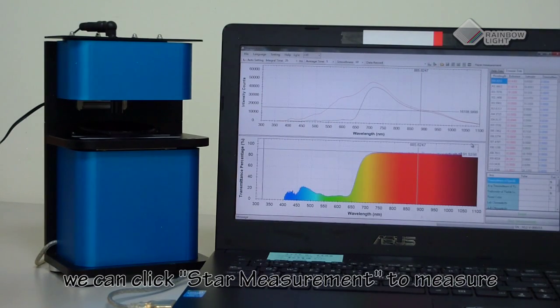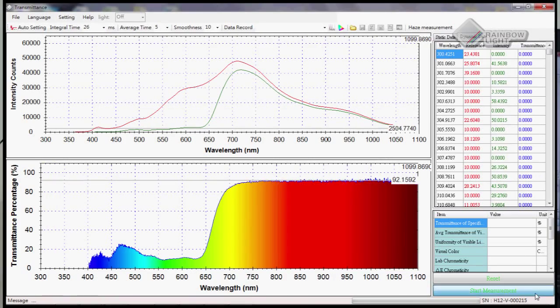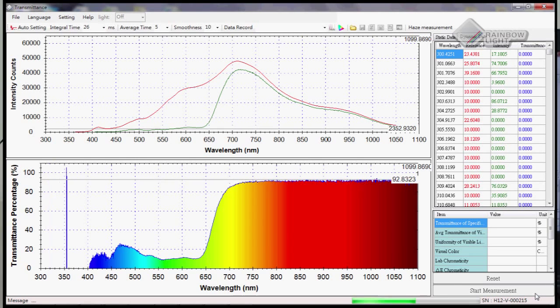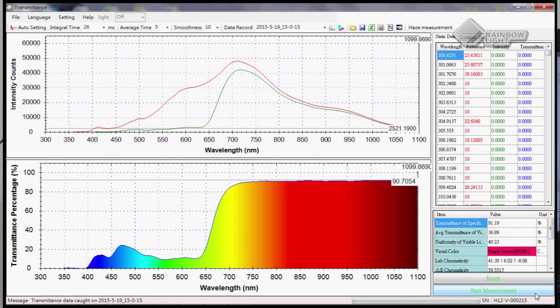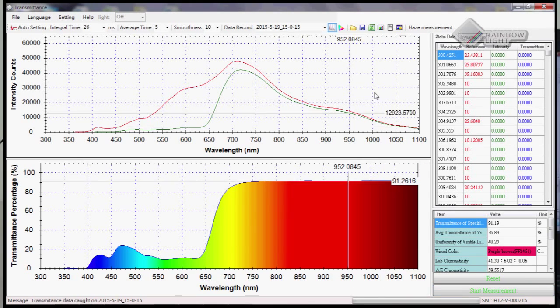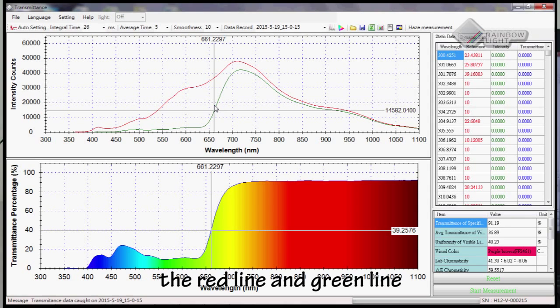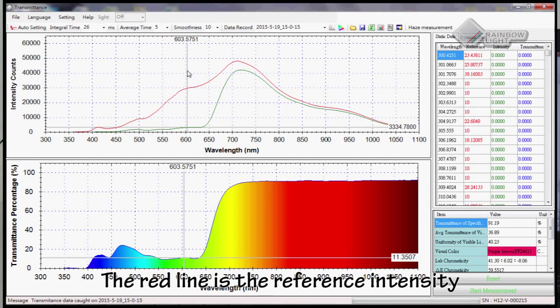Now we can click start measurement to measure. After measuring, we can see the red line and the green line. The red line is the reference intensity.